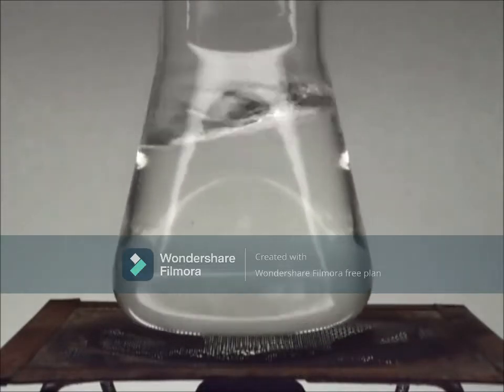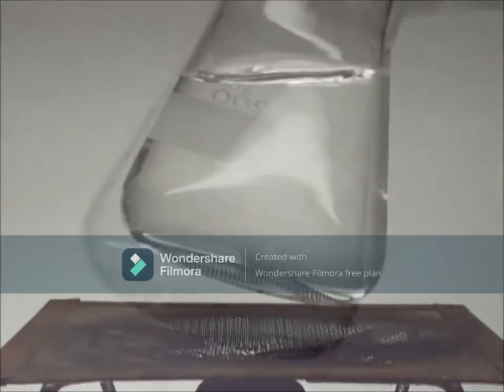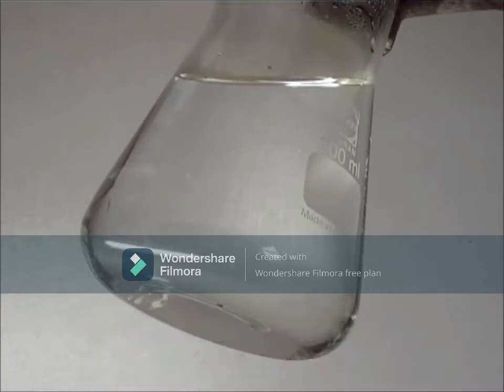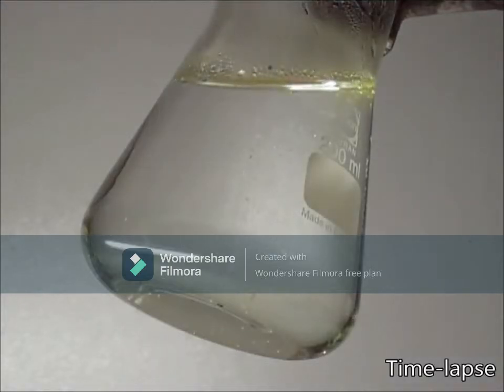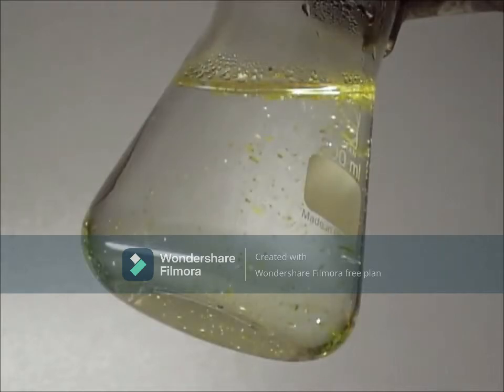The precipitate dissolved because at higher temperature, solubility increases, allowing the precipitate formed earlier to dissolve to form a colorless solution. However, upon cooling, crystallization starts to occur, where crystals of lead-2 iodide were forming.